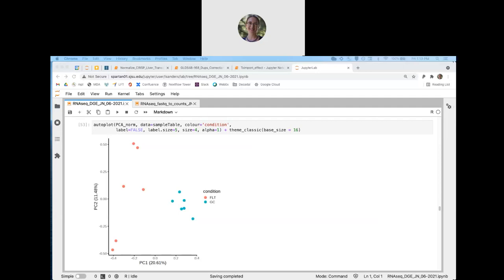All right. Let me just share my screen here. Oh, I am sharing my screen. Good for me.